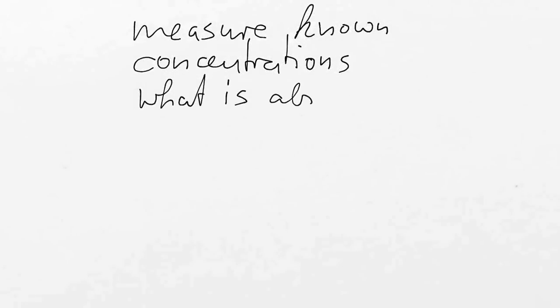So if we still want to calculate our concentration, what we can do is measure known concentrations of a substance and see what the absorbance is. So we prepare samples with different concentrations where we know the concentration, and we plot.